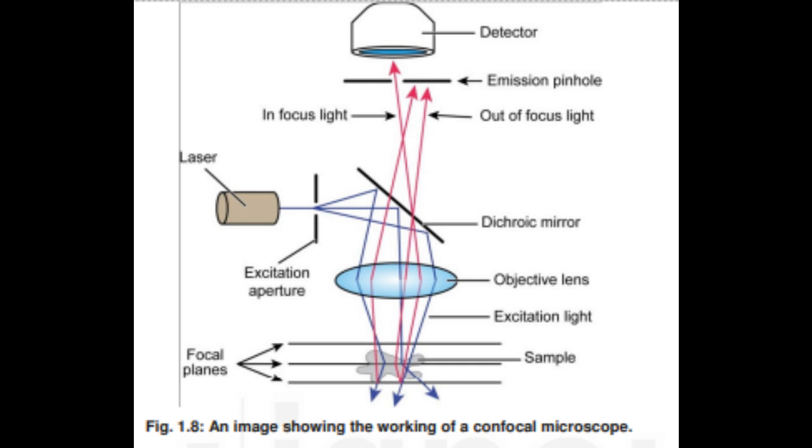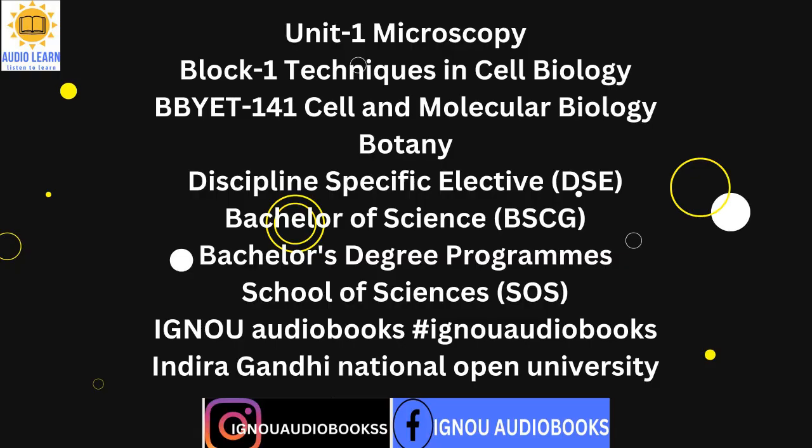Polarizer is a device that transmits polarized light through the specimen. Analyzer is a device placed above the objective. An analyzer fitted to the eyepiece blocks polarization of the light. The analyzer is rotated to get maximum contrast in the image, and a difference in refractive index between planes is determined. Polarization in the beam of light is removed by using objectives with low numerical aperture.